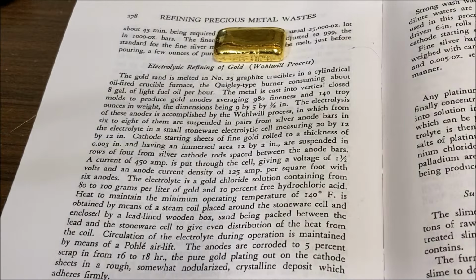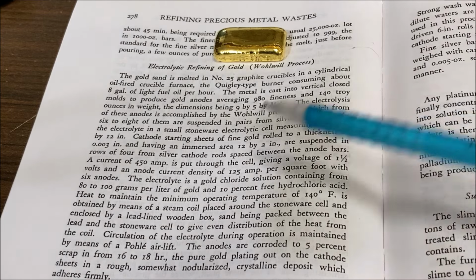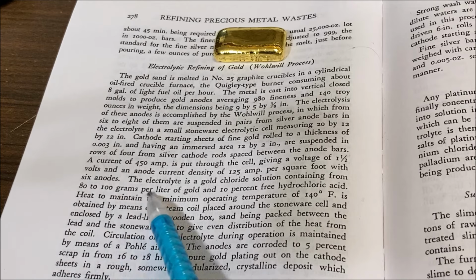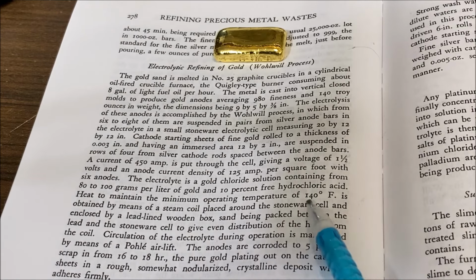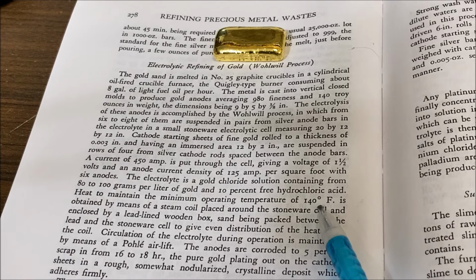There's a couple of more parameters we're going to use here. We're going to use a voltage of 1.5 volts. We're going to use a gold chloride solution that is 80 to 100 grams per liter of gold, and that's why we're refining this gold in this video. We're going to use that gold as our electrolyte for the electrolytic gold cell. It says here to maintain the operating temperature of 140 degrees Fahrenheit.